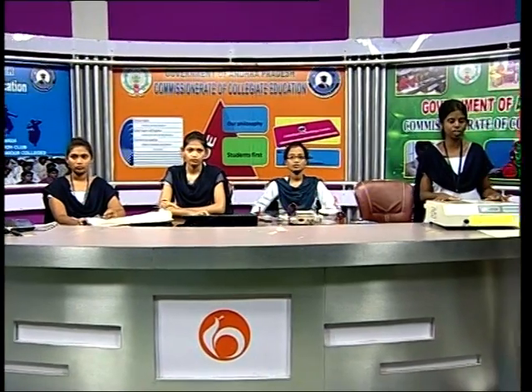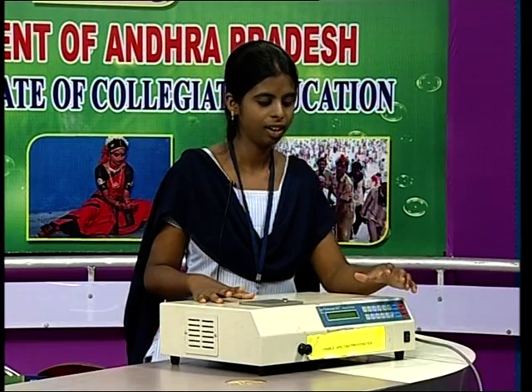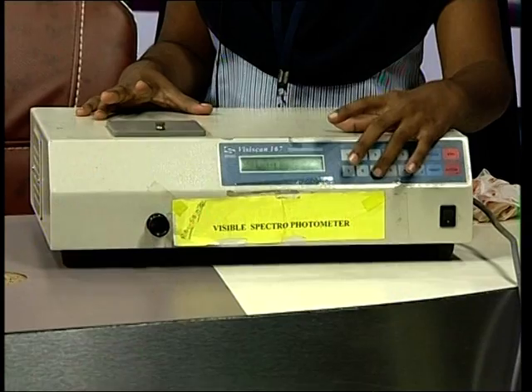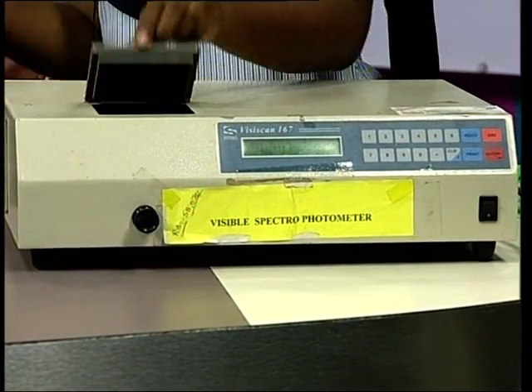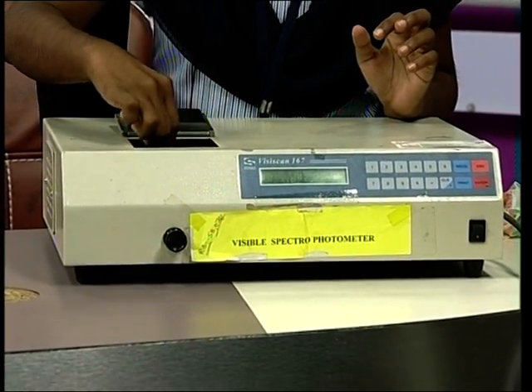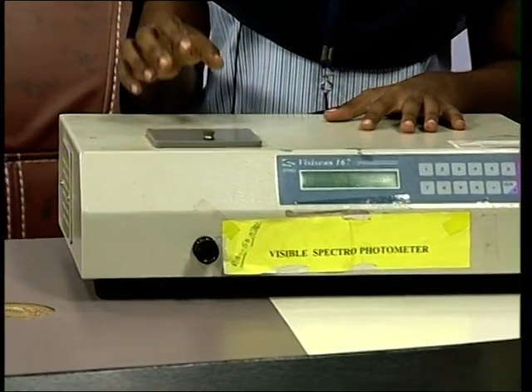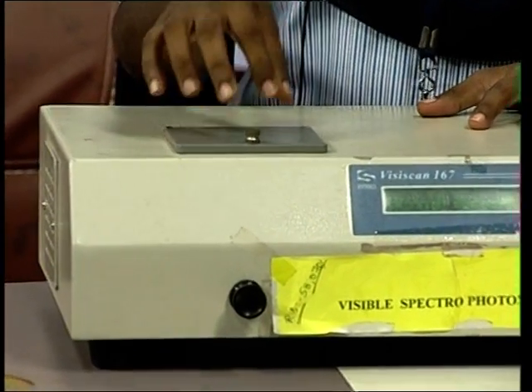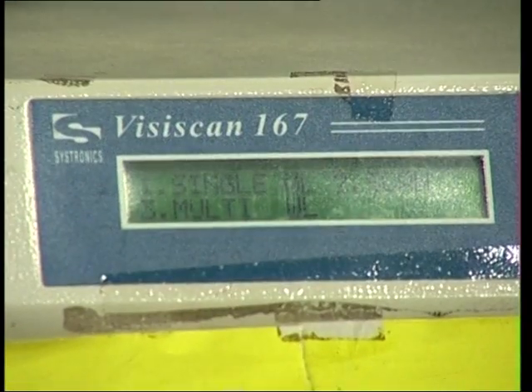While coming to the basic instrumentation on which this spectroscopy deals, this is the instrumentation for UV spectroscopy or visible spectroscopy. Here we must select or enter the required wavelength on which this spectroscopy works, and then place this cuvette which contains a sample solution into the respective place provided in the spectroscopy instrument and then close the lid. When the light passes on to the sample holder, only a few of the substances present in the sample holder absorb this visible radiation.